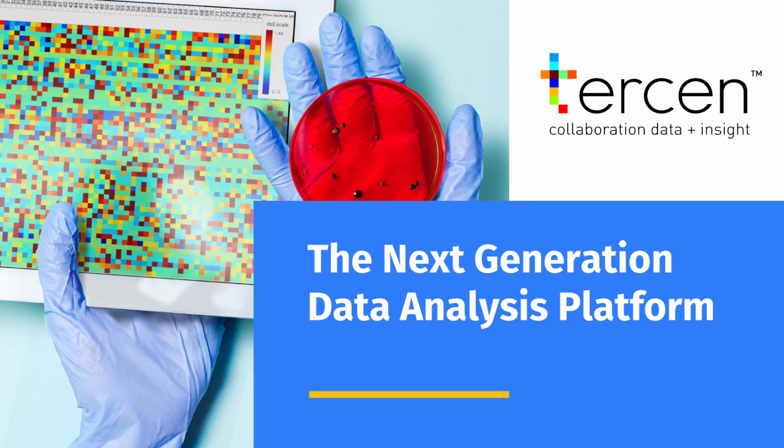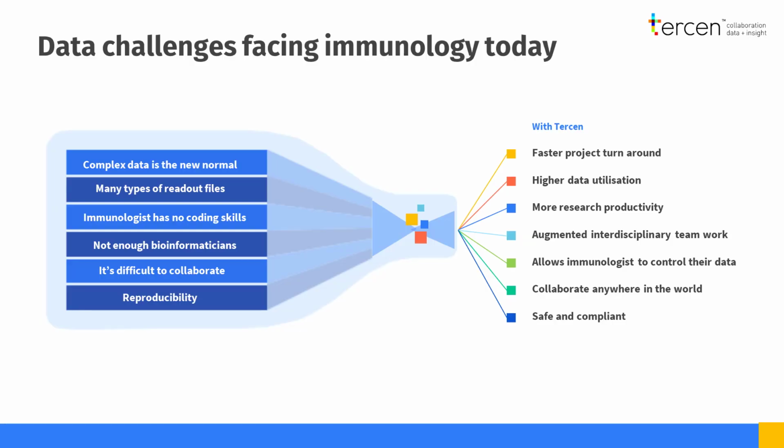Hi there, my name is Martin and I want to tell you about new software which can change the way immunologists analyse their data. Modern lab instruments are producing a deluge of high quality data that often goes underutilised because immunologists don't have the computer programming skills to take advantage of it.